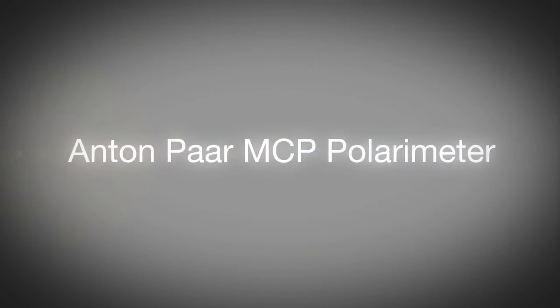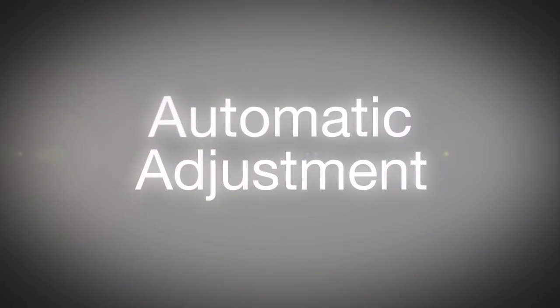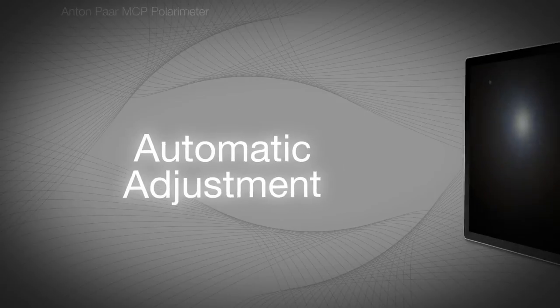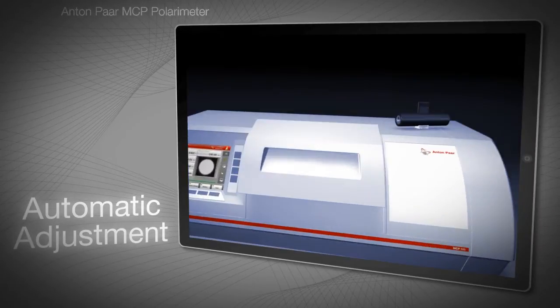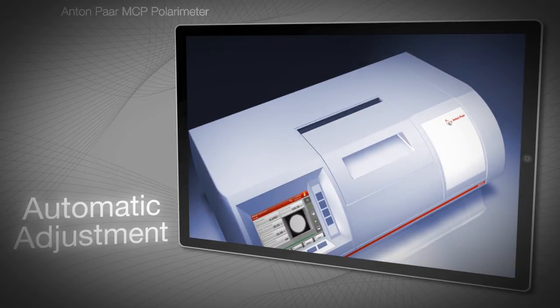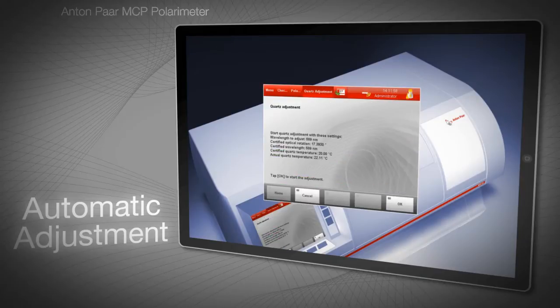The MCP series of polarimeters is produced by Anton Paar, a global company renowned for manufacturing high-quality instruments for measurement and analysis. This video explains the adjustment of MCP polarimeters, which is automatic, user-friendly and fully traceable.